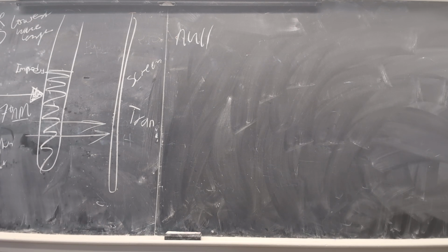Alright, we ready for the color change. We're gonna turn into melanin and make it the black. Okay, so now what's the next step? Have one test tube, only water, so you can calibrate. You tell me what's the next step. To find out what's happening, you need to take one tube, label it as water for calibration, and just fill it with water.